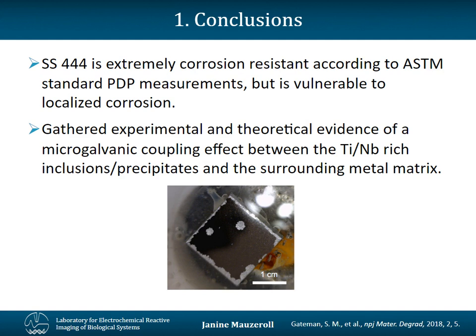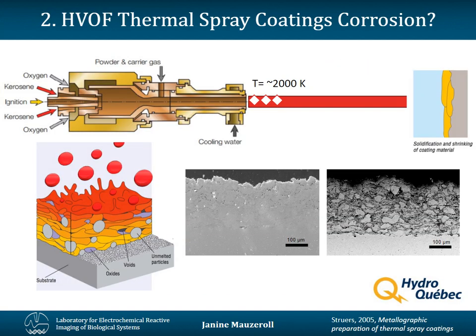So that's a nice example about how SECM can be used to study a broad range of corrosion alloys and focus on the impact of the inclusions in these alloys. Now, another industrial process related to alloys involves HVOF thermal spray coatings.